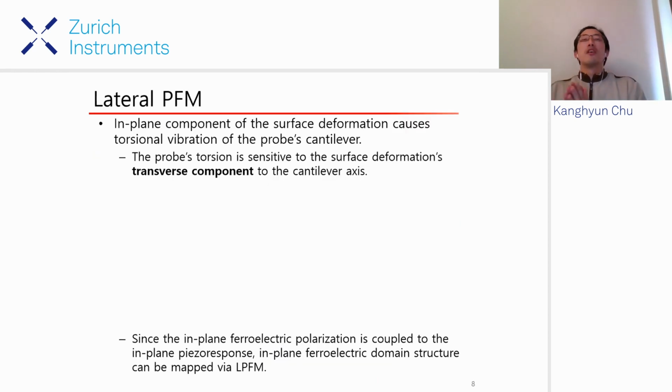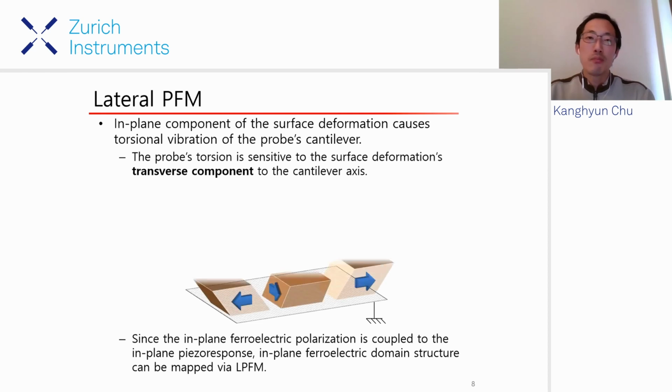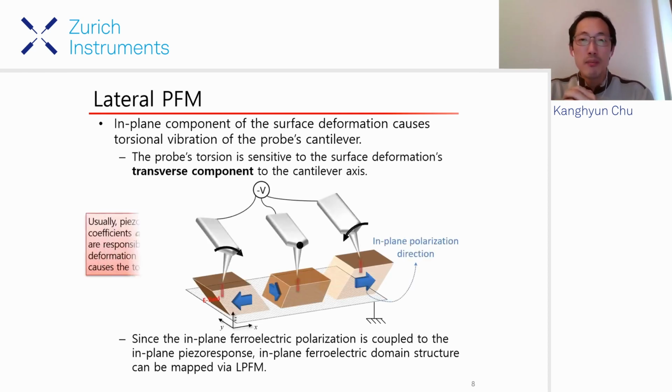And now let's move on to the lateral PFM. So far I explained the PFM for the out-of-plane response, but a similar thing can be done for the in-plane response. Instead of using the out-of-plane motion, we can use the in-plane motion to get the piezoelectric property information of the sample.